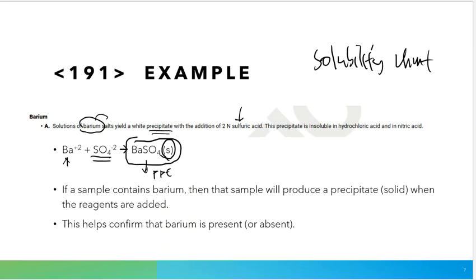If barium is not present in our barium-containing sample, then barium will not react with the sulfate, and no precipitate is going to form. And then we go, uh-oh, there's no barium in my sample. I'm going to have to figure out what this thing is, and then maybe we go through those motions. But really, for the monograph pieces, we do the test that's listed, we pass it or we fail it, and we move on.